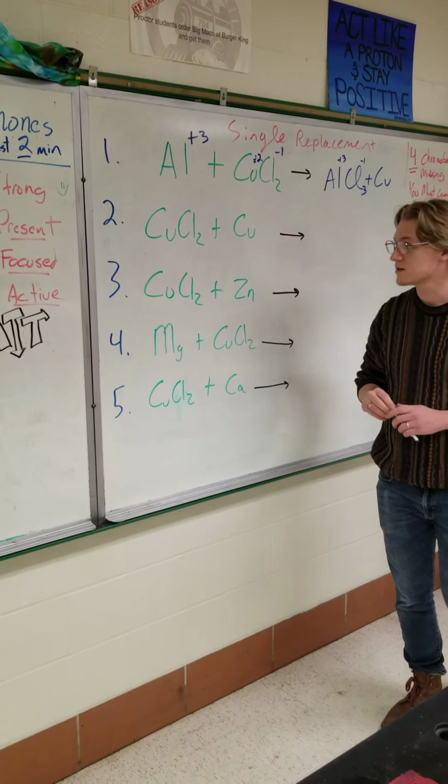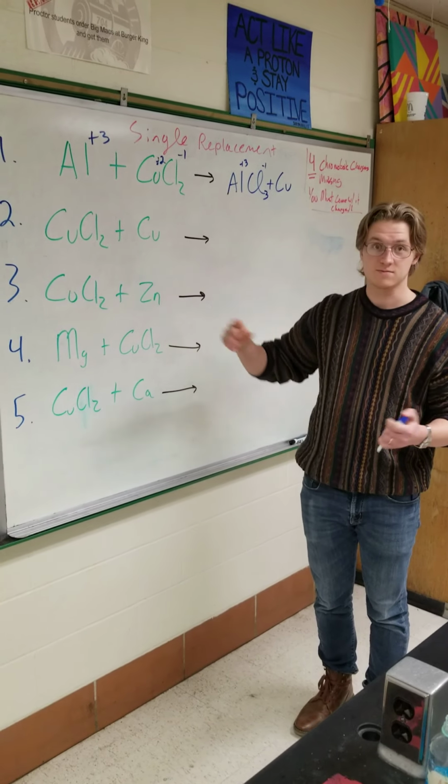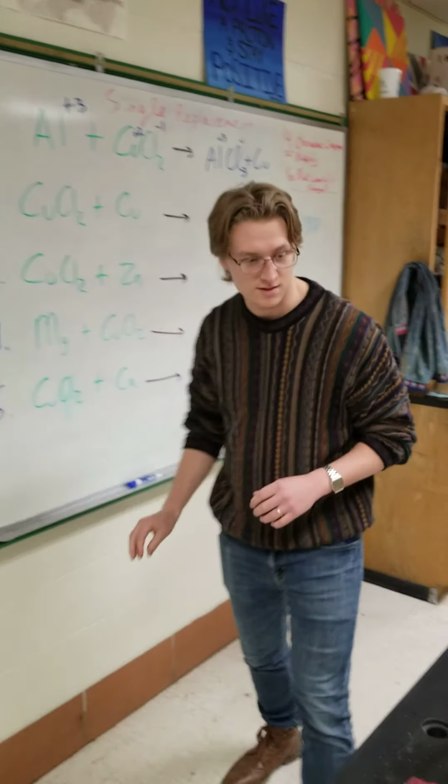Second one here is we're taking the copper chloride solution and we're mixing copper with it. So let's take a look at this one.